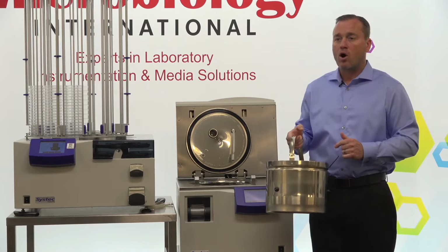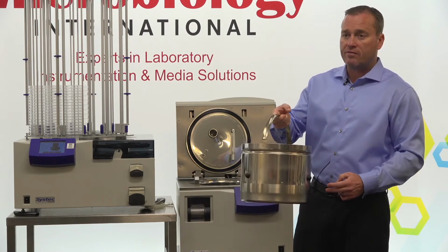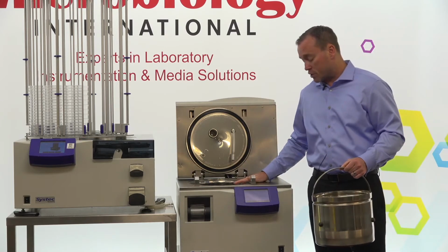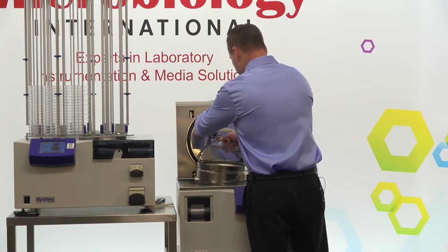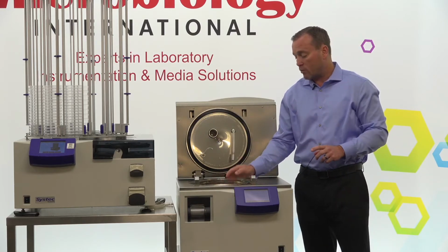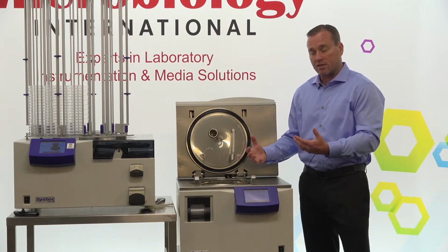One really nice part about the way that the vessel is loaded into the unit is that there are spacers located on the side of the vessel. So there is no specific orientation for how this unit sets down into the sterilizing portion. It just simply sets in, and then it will find where it needs to be. So the heaters are located at the bottom. When we would start a cycle, water would flow to the outer vessel, and then our heaters would turn on, create the heating jacket for this, and sterilize the media.